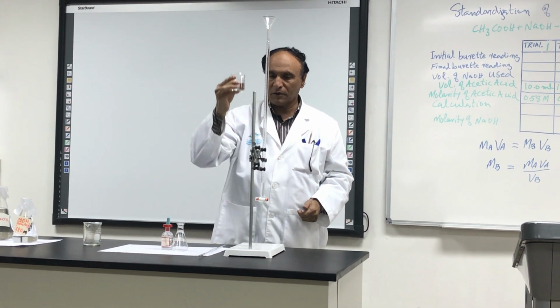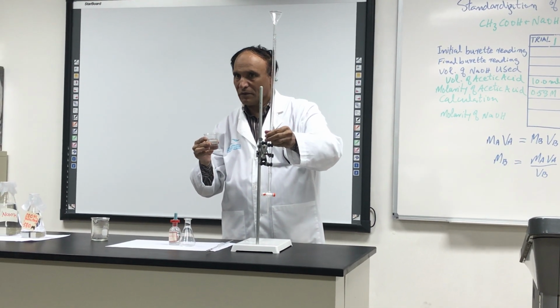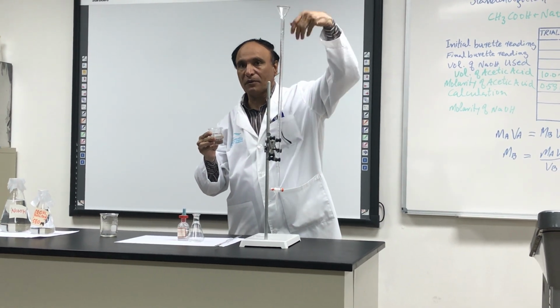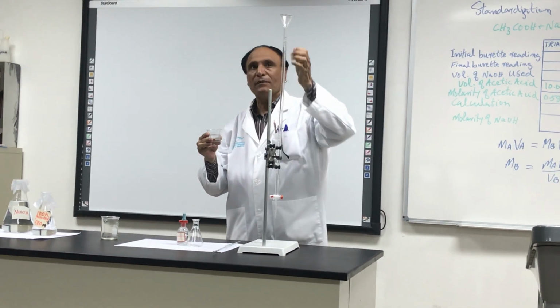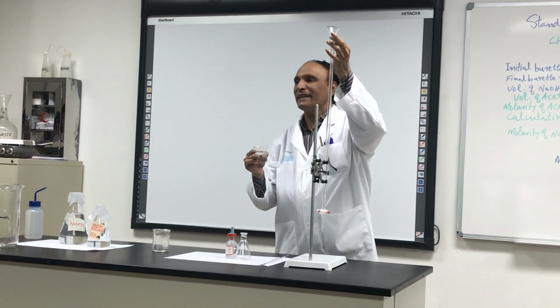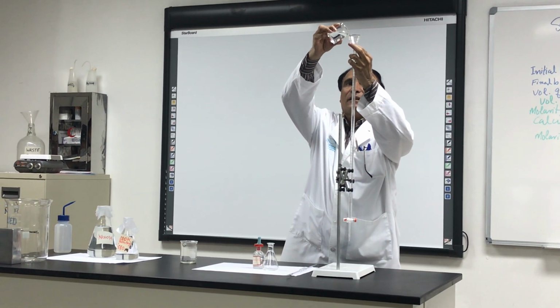When you fill with sodium hydroxide, there is air inside. Sodium hydroxide is going down. Sometimes this liquid bumps out. So the best way is you just move it a little above. Give a space for the air and add into it.